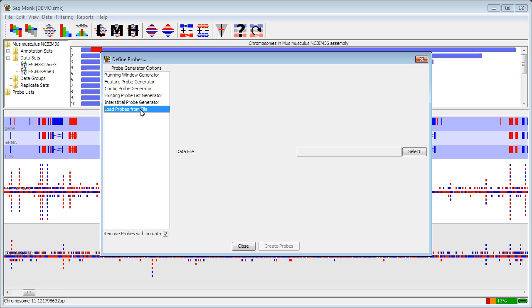And then finally, load probes from file is the sort of default option that if you can't make the probes you want any other way, you can load in a set of positions to use as probe regions. So if you had an external peak caller, for instance, you could just load the probes from the output of that file straight into SeqMonk.